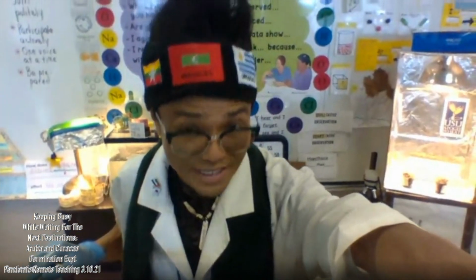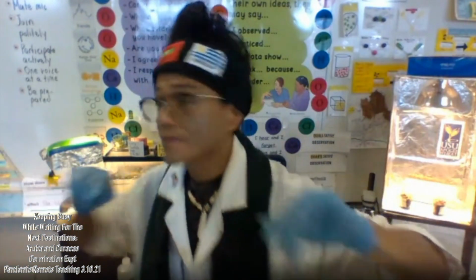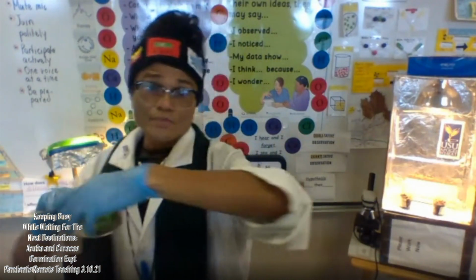Okay, we're going to start with the seed. This is one of the seeds available in the office. So beginning today, as you know, you can go and ask for supplies so you can set up your next project. That's why we are taking time to be together, and I will show you step by step how to let the seed grow without soil at all. All right, let me get the seeds that I need. So let's start the story.